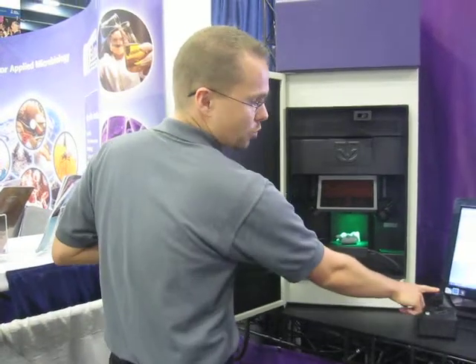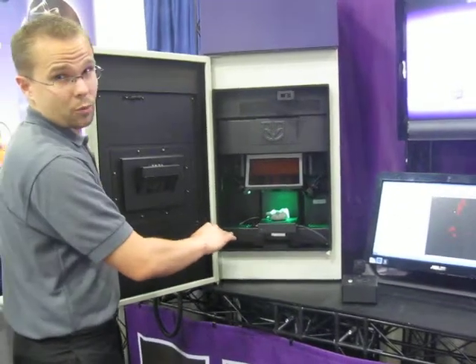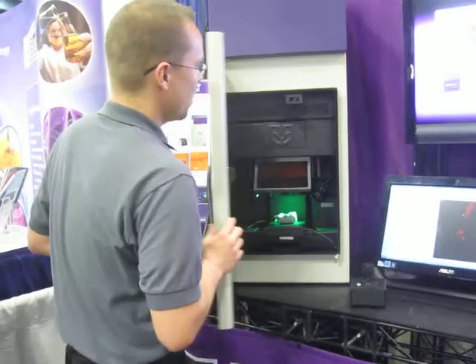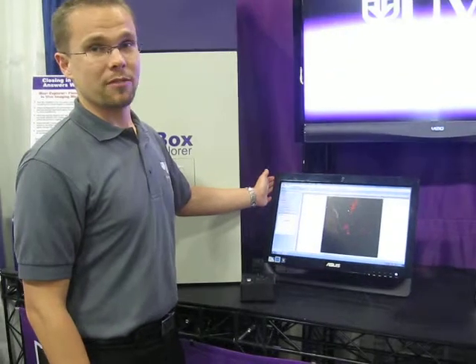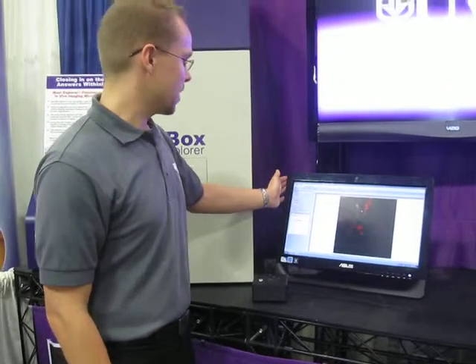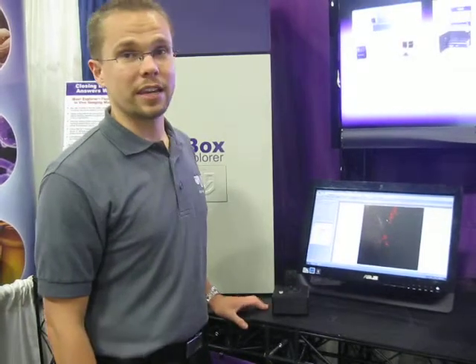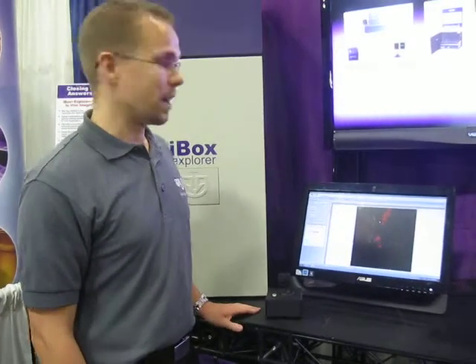The platform is controlled by an external joystick which moves the platform in an X, Y, and Z direction. A variety of options are available within our VisionWorks LS software to control the system itself, including adjustment of the emission filter, selection of the magnification within the system, as well as a location map of where the platform is.